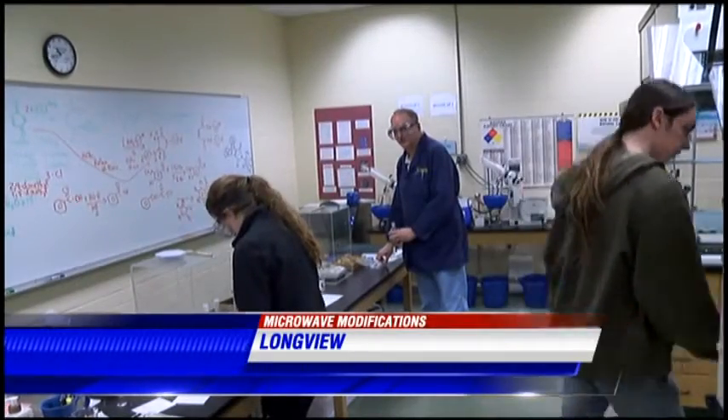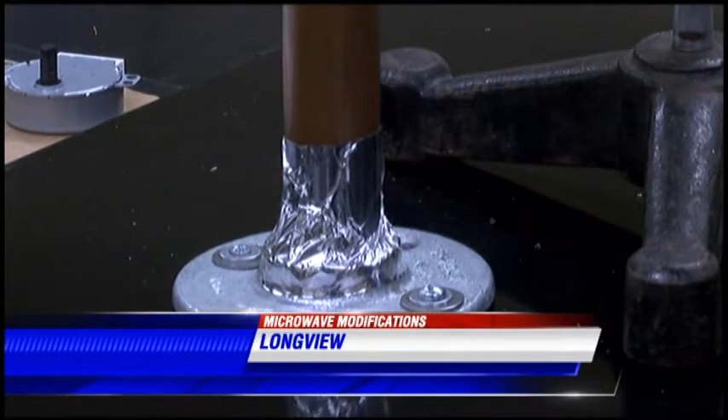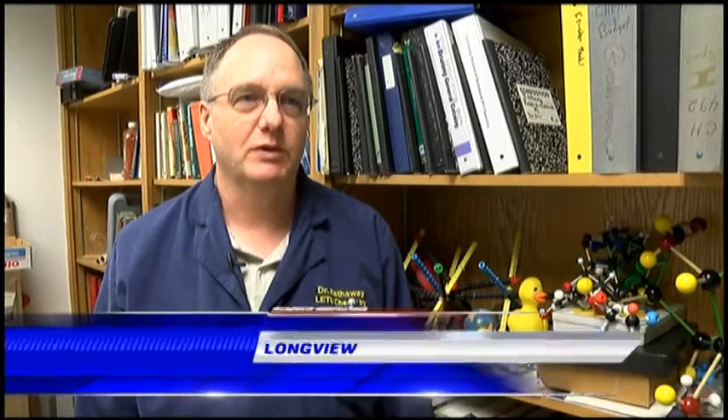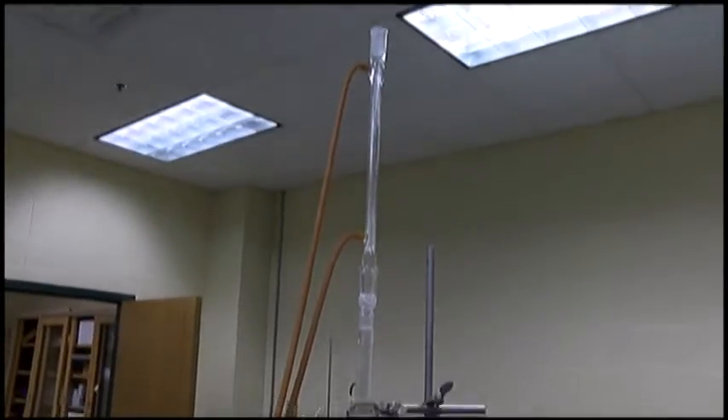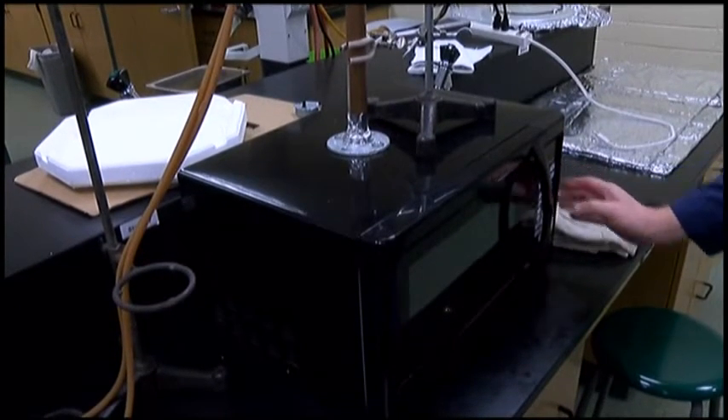Laterno professor Bruce Hathaway says it's a project that's been done before elsewhere, but the modification he's working on boils down to saving his students time and the department money. Some people actually did modify regular microwave ovens like we are and showed some effects, so we're really trying to reproduce some of what they did — kind of like going back to the 80s. This version is a little more advanced than the 80s models, but the concept remains the same.